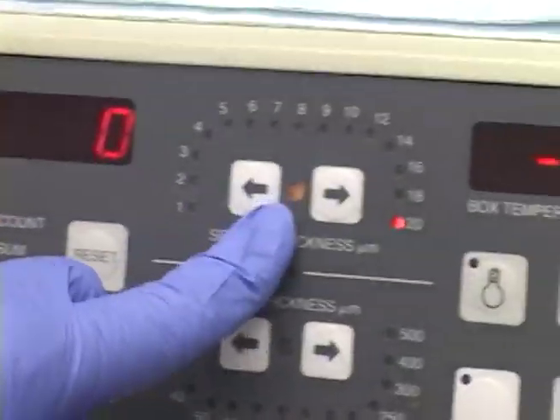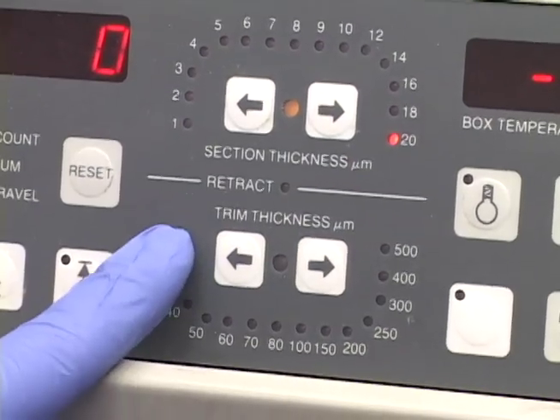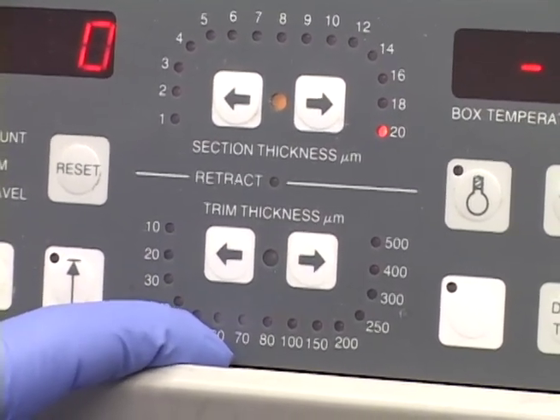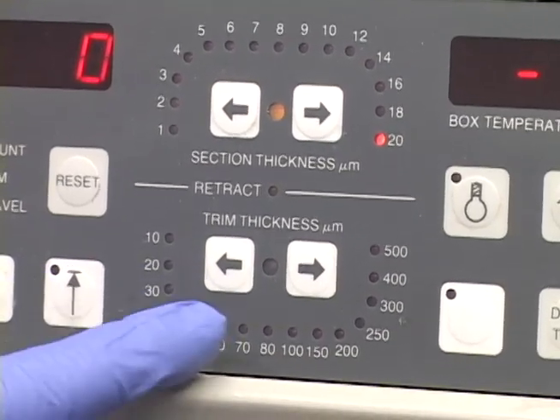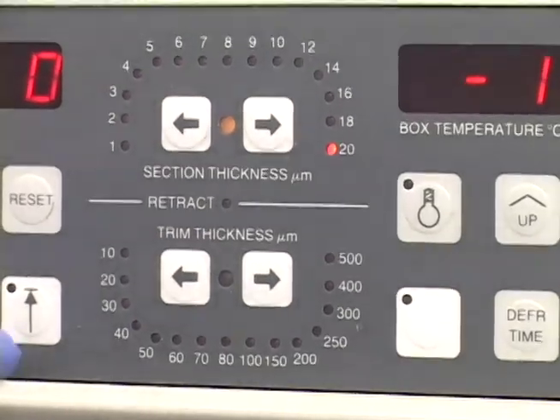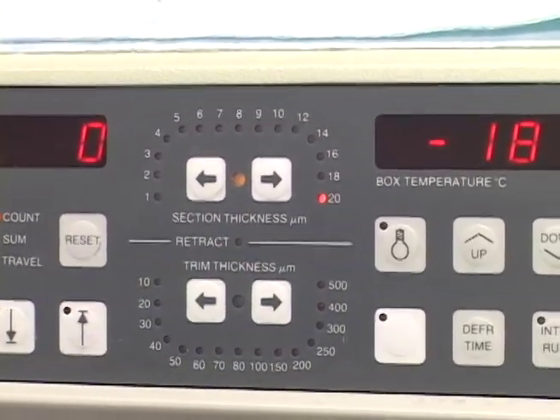These are your micron levels. We have it going up to 20. When you start going into this area — like 30, 40, and 50 — our microtome is unusual in that you actually have to set it to this trim thickness. We're not really able to accurately use those as far as I can tell.